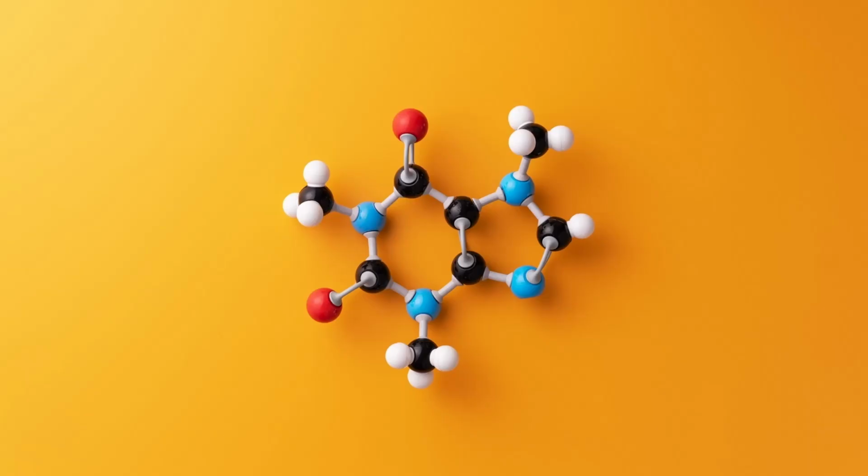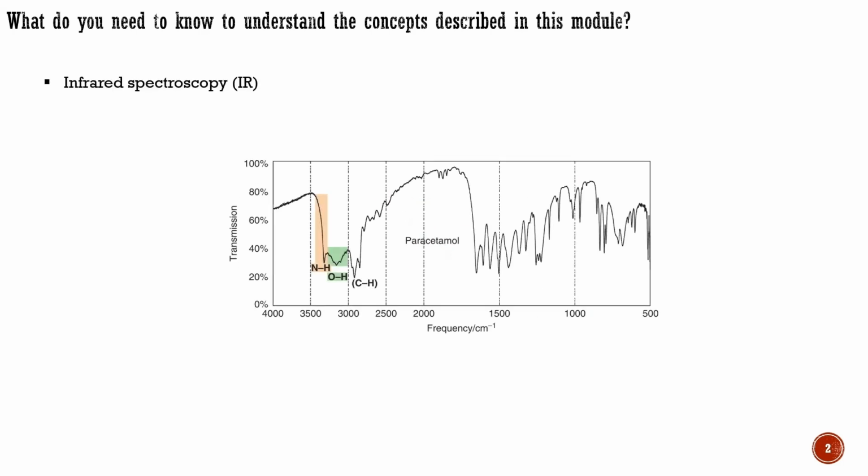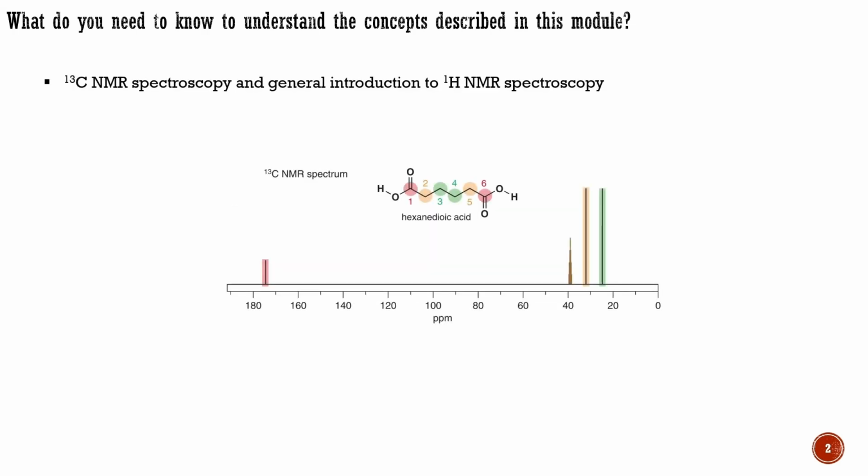Greetings to all, and a warm welcome to the module devoted to proton nuclear magnetic resonance spectroscopy with applications to organic chemistry. In a separate module, I introduced nuclear magnetic resonance, NMR, as part of a 3-pronged attack on the problem of determining molecular structure. I showed that mass spectrometry weighs the molecules, infrared spectroscopy tells us about functional groups, and carbon and proton NMRs tell us about the hydrocarbon skeleton.